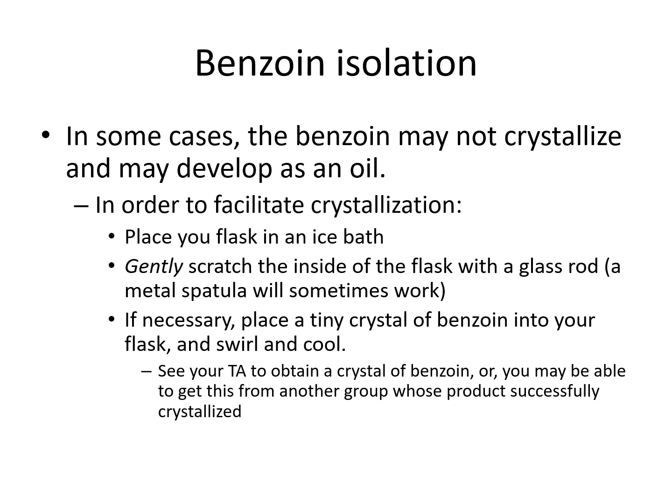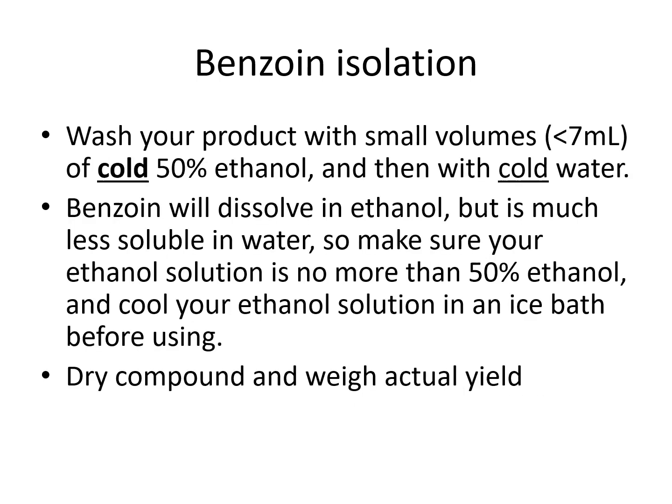If we have a pure benzoin in the lab, that's the preferred way to use. Otherwise, we will be using the benzoin from other groups who have already synthesized the benzoin.